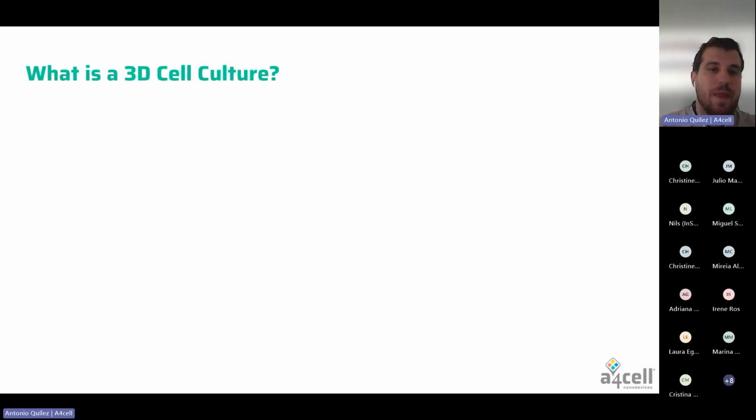So first of all, I would like to begin with this question: what's a 3D cell culture? I asked myself the same question when I had to prepare this webinar, and what came to my mind was, okay, I can ask the AI. So let's see what they think a 3D cell culture is.